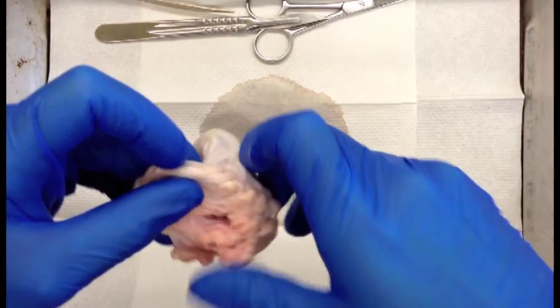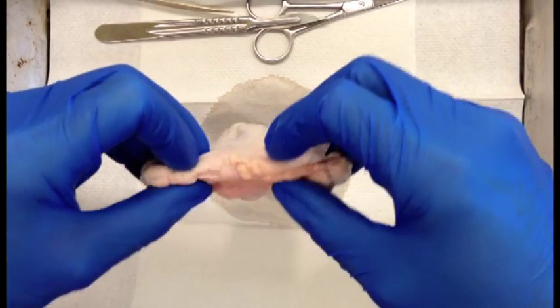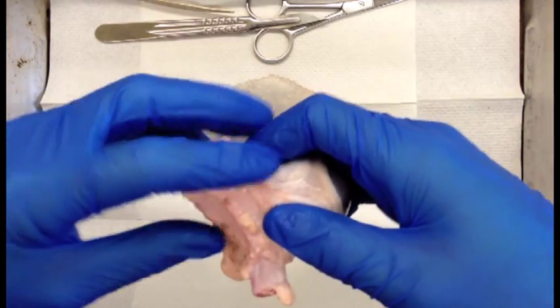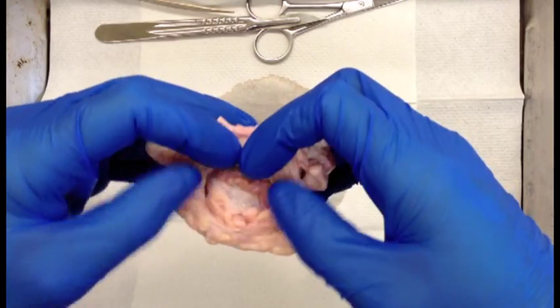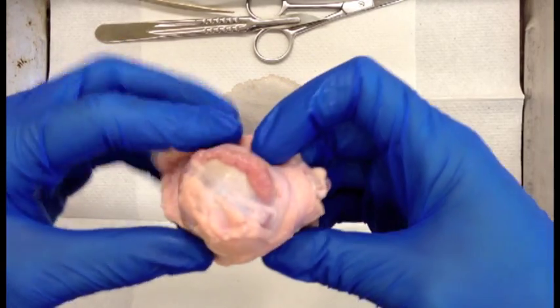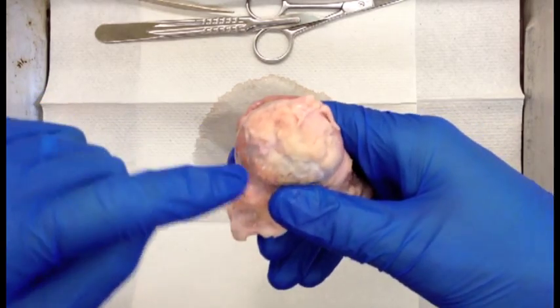We look at the back part and you see all this stuff hanging off the back of the eye, and almost all of this is actually adipose tissue. So the eye is surrounded by sort of this adipose padding. And if we go ahead and peel some of this adipose tissue back and look at the posterior side of the eye, you can see here some skeletal muscle all around the eye.